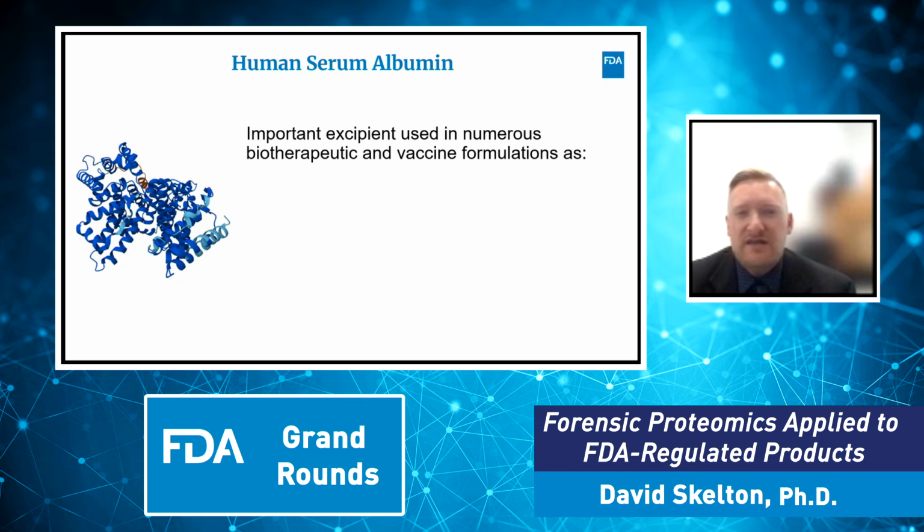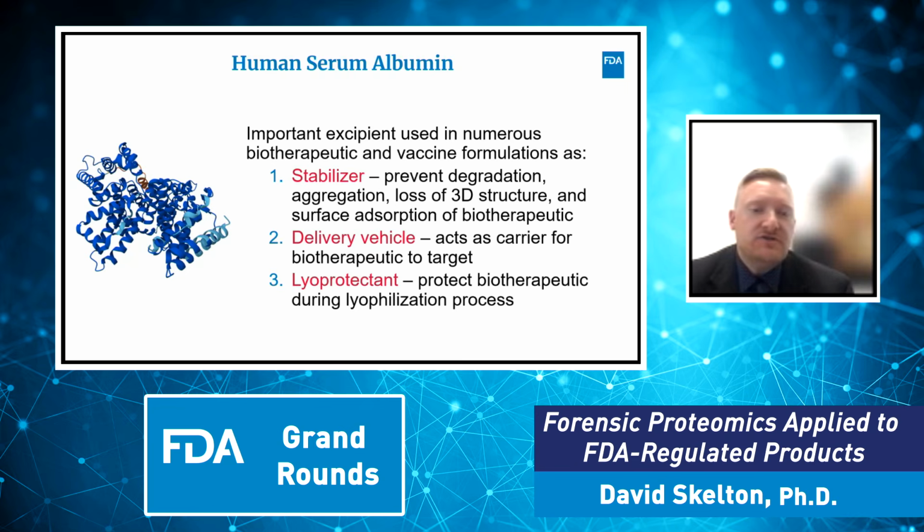This is a protein that we analyze a lot here at the NFCC because it's present in numerous biotherapeutics and vaccines, where it's added into the formulation to stabilize the active biotherapeutic. It can also be used as a delivery vehicle to carry the biotherapeutic to its intended target. And it's also used to protect the active biotherapeutic from degradation during the manufacturing and storage process.